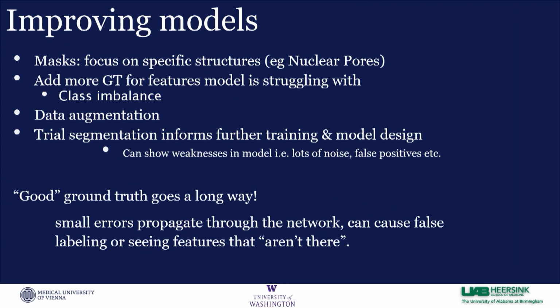And a few more tips that I have just from personal use. It might seem irrelevant or redundant to most of you, but it can help if you're just new to Dragonfly and deep learning especially, and you're just figuring out what to do. A lot of my research came from watching Mike's videos and just trial and error and just playing around with settings. So one thing that can be helpful is getting a mask for training and kind of focusing or showing the model where you want to have the attention focused.